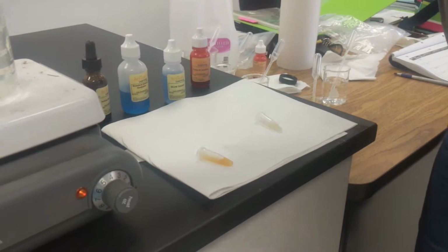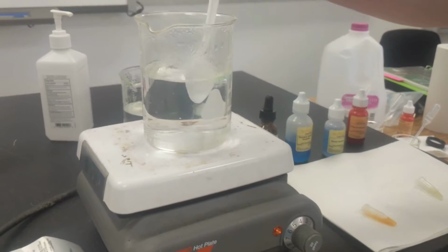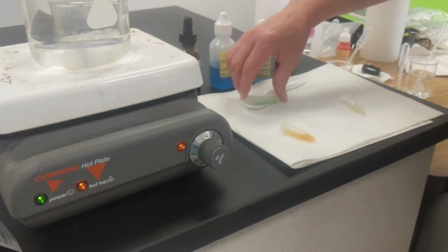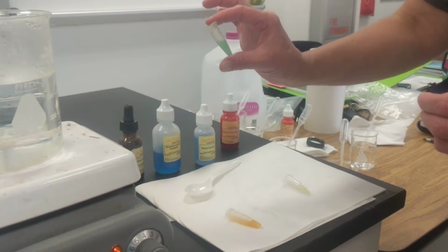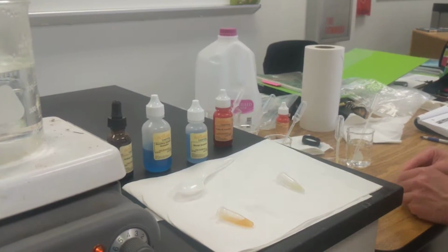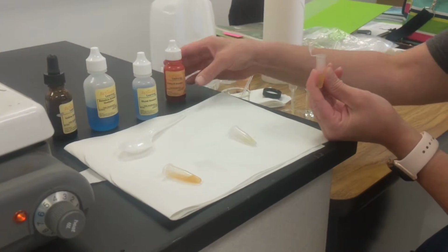Let's do a quick little check on our... And I think I need to stir this up because I think it separates. Okay, we're still looking kind of green, so let me pop that back in there for a moment. All right, let's do our Sudan test, which is for fat, okay?